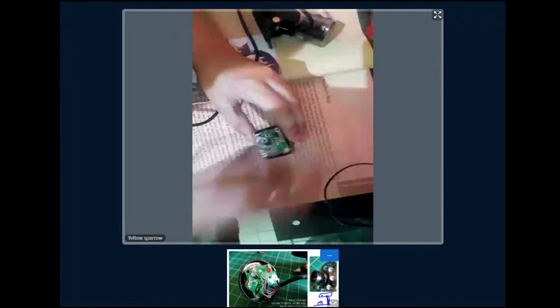So in this, what do you see? There will be 2 more screws there. Can you see that? There is 1 screw. Yes, sir. 2 screws are there, right? Only 2 or more than that? Right. You have to remove them, just like these screws, right?